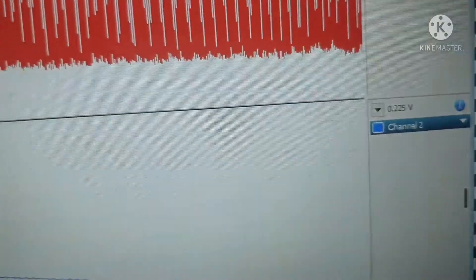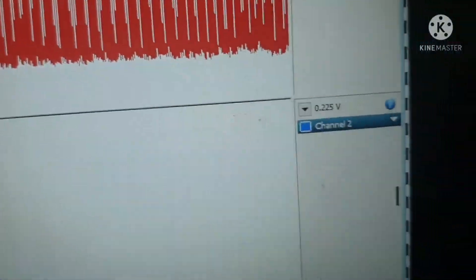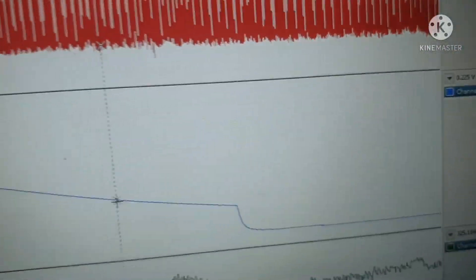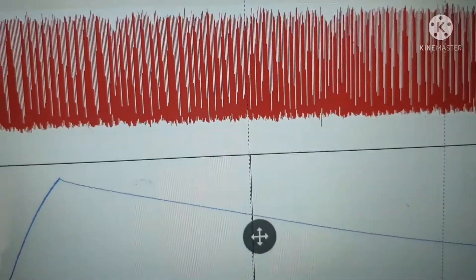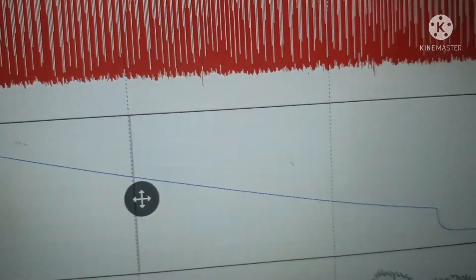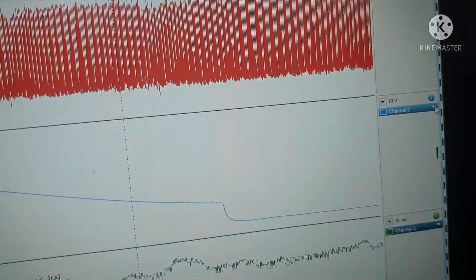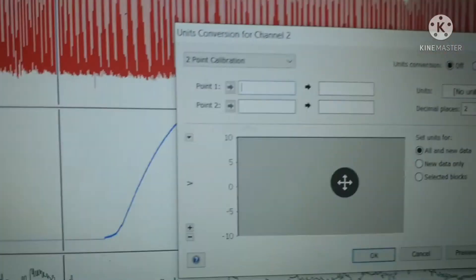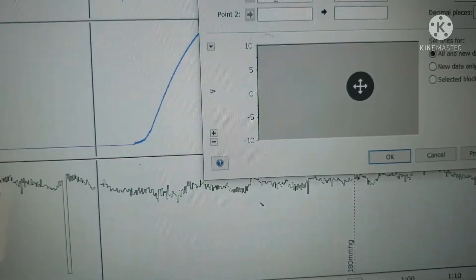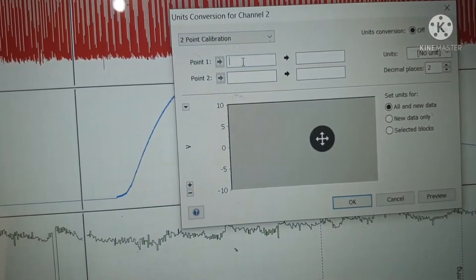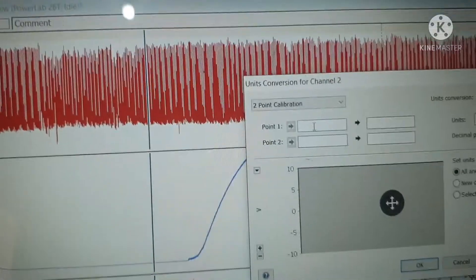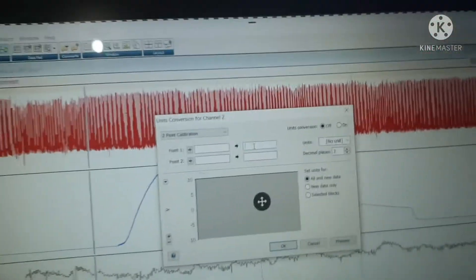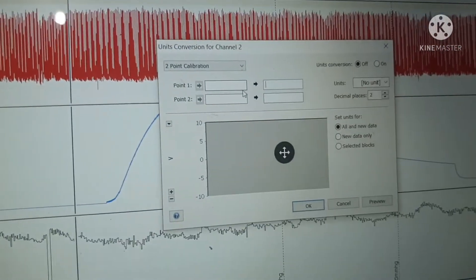At 120 mmHg, channel 2 gives 0.225 volts. We will use these two points for calibration. Now go to the icon at channel 2, click it, go to unit conversion. In unit conversion, we put two points. For 180 mmHg, we enter the value 180 mmHg.